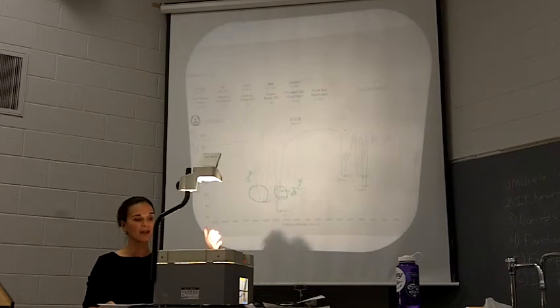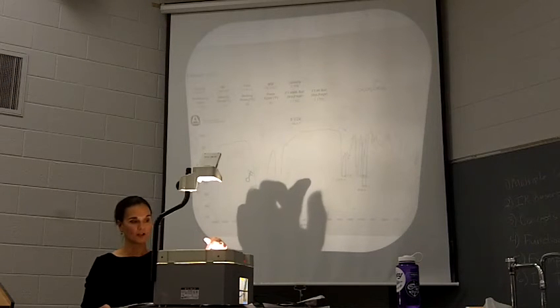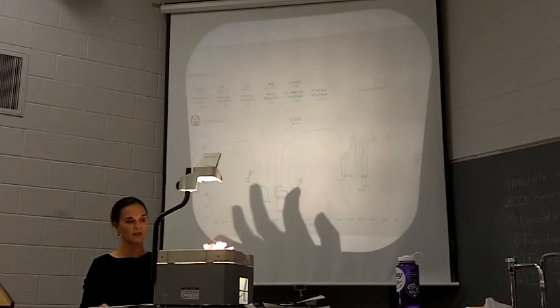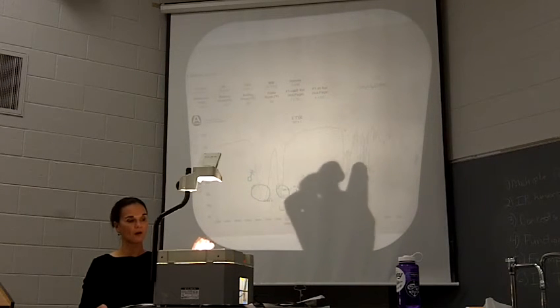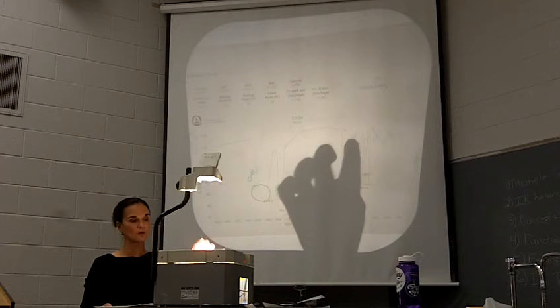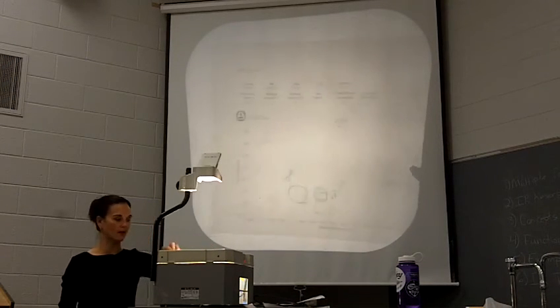Now, other things that you would want to identify if you have an alcohol is, again, your sp3 CH stretch, because you still have probably sp3 CH carbons, like here in butanol. And then look also at the CH2, CH3 bending that's on your yellow sheet, because that's down in this region. And you would see some of that with an alkene as well.